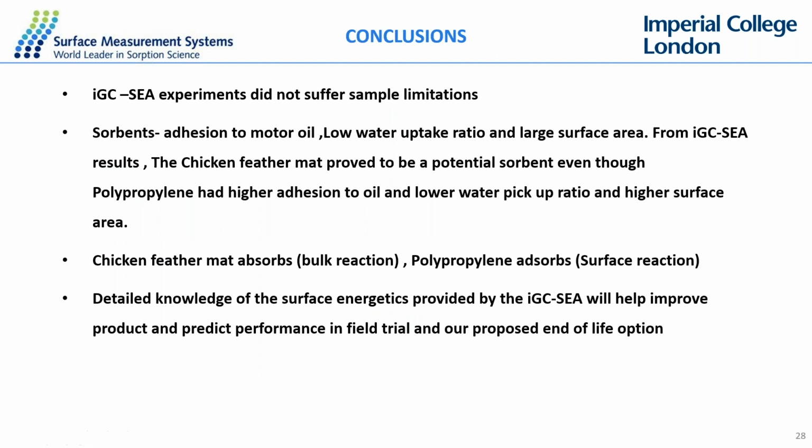So basically, from all the different results and tests we had, we see that for the IGC experiments, there was no limitation because of the kind of sample we used. We were able to get our results without any problem at all.